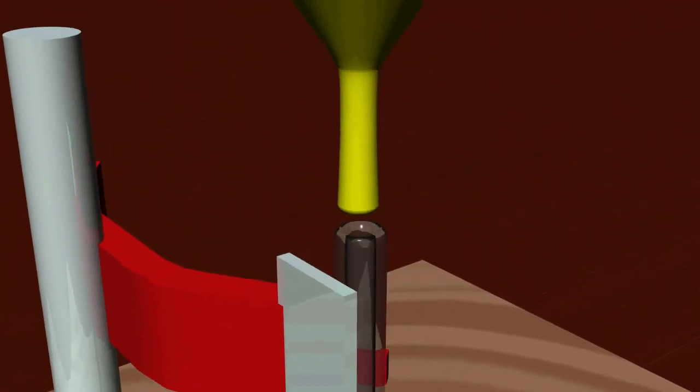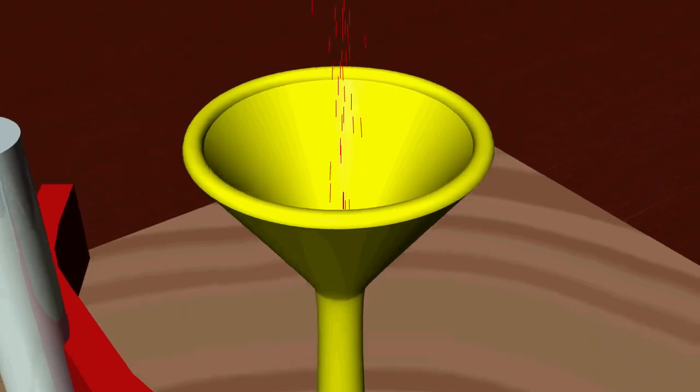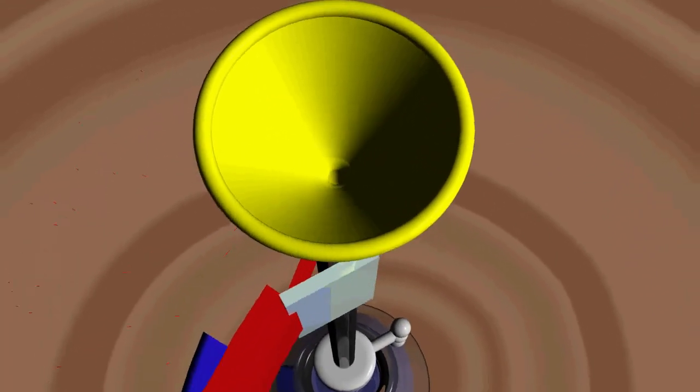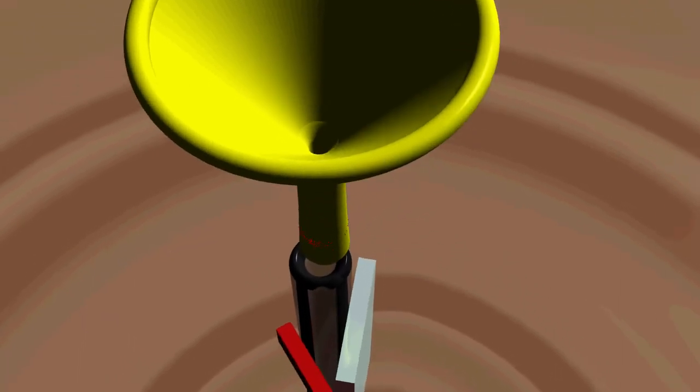Now, using a funnel, place your titrant into the burette. Do this carefully and slowly because the burette, although long, only holds about 50 milliliters and it's easy to spill.